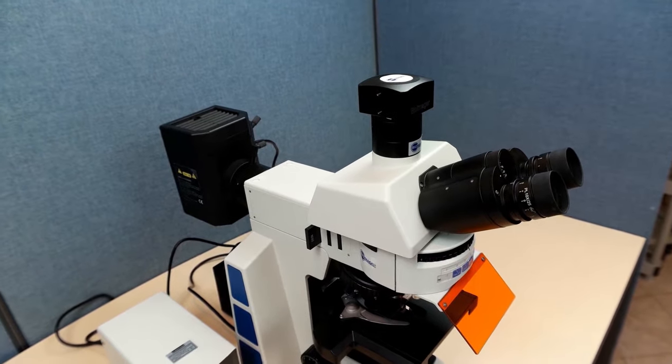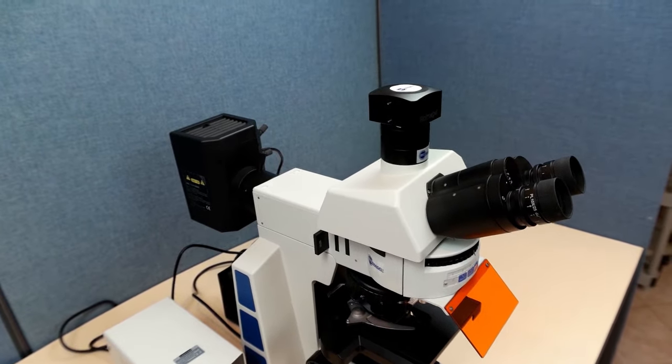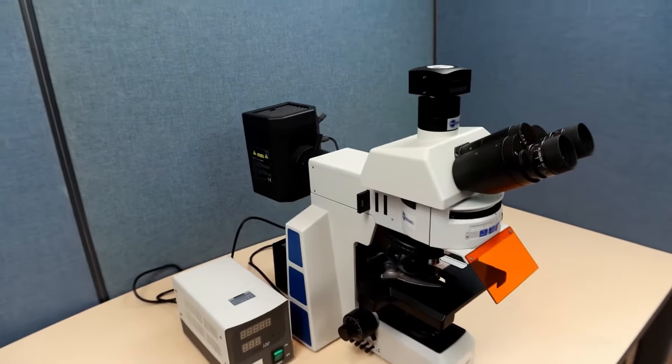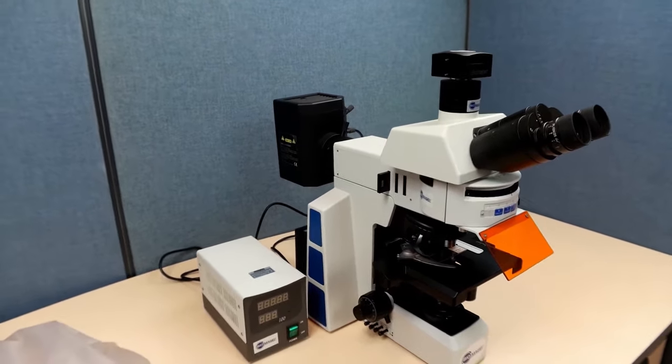In this video I would like to review one of our advanced research microscopes, the BUM800FL Upright Biological Microscope.